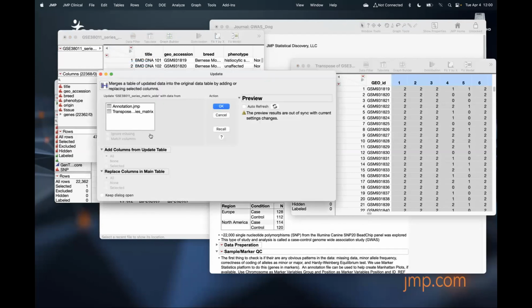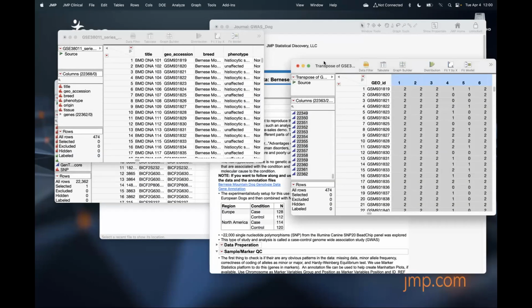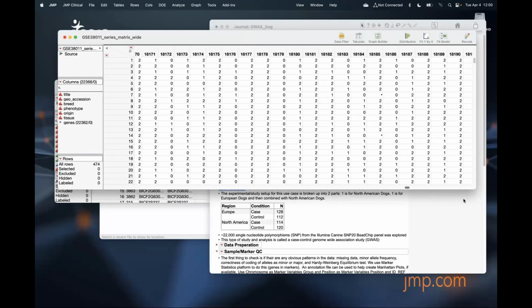Let's go back to our update. Ooh, there we go. Verify real quick. All right, good.